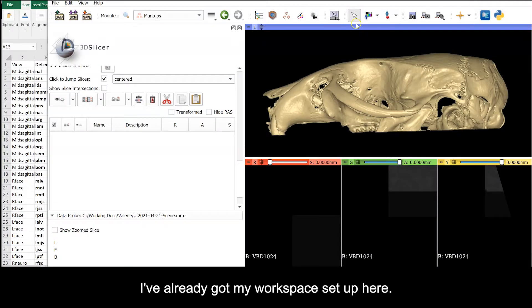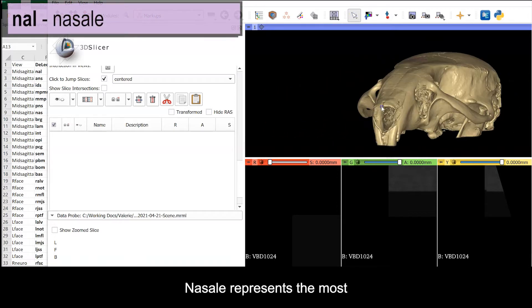I've already got my workspace set up here, see the links below for tutorials to get started with that. Nasale represents the most anterior rostral point on the dorsal nose.